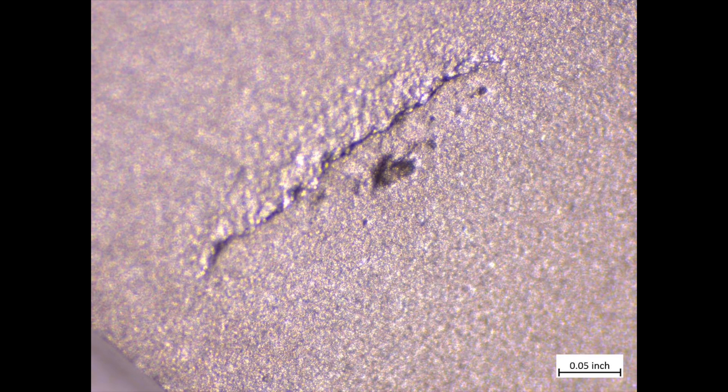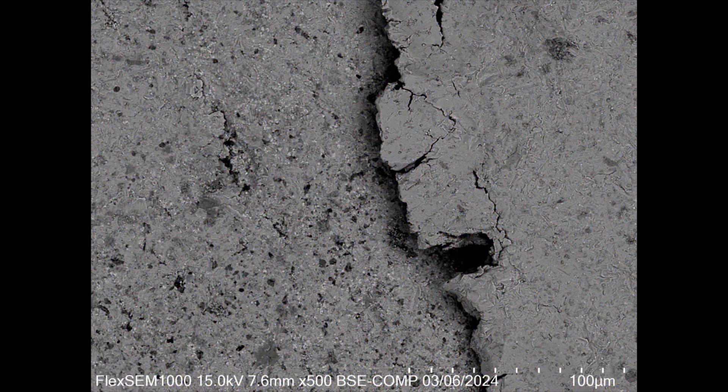Already you can see under this higher level of microscopy that this is in fact a delamination situation resulting from a poorly bonded pocket of softer material within the MagnaCut.